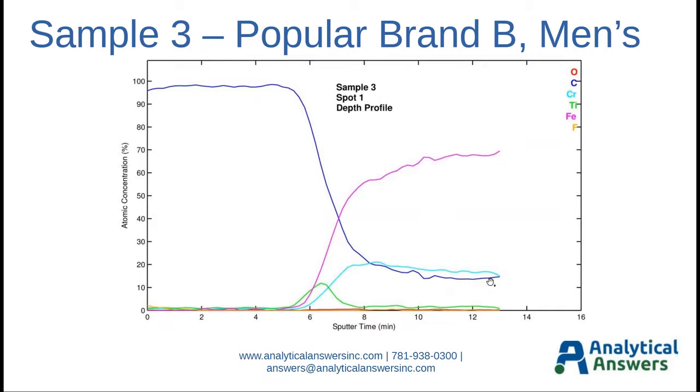And that carbon layer that we found after sputtering varied quite a bit because sometimes the spot that was selected happened to sit on several of those little chrome carbides, and other times it sat on just one or just eclipsed a partial one. So there was a lot of variation in post-depth profile carbon concentration in the depth profiles.